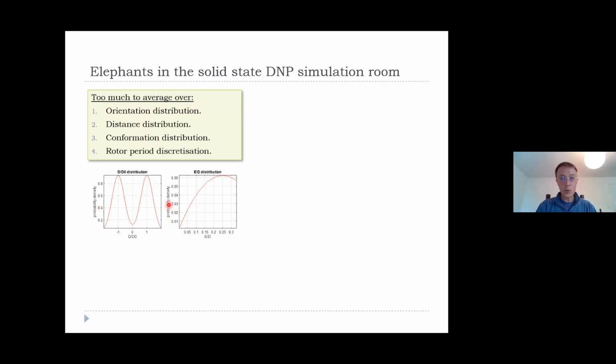And then distributions of some internal parameters. And if we start counting dimensions, we are talking 6, 7, 8 dimensional distributions. And if you've got 10 points in every dimension, that's 10 to the 8th, right? 10 million, 100 million, game over, right? So the problem is hard, not so much because the spin dynamics is hard. It isn't. The problem is hard because the system is horribly badly defined.